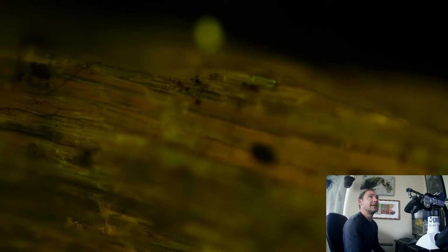But holy cow, yeah, there's a lot of fungal hyphae. You can see they're not glowing, but that's fungal hyphae in the root. So it's some sort of endophyte. Might not be AMF, or it actually could be AMF. Not really a good way to tell unless you see those inoculation points where the phosphorus is really glowing, which I bet we'll see if we can find.